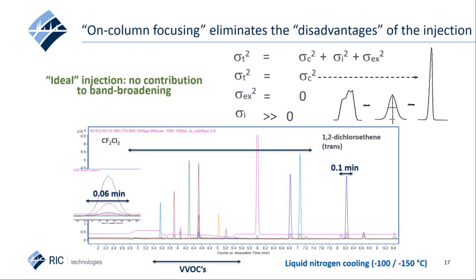Important, we eliminated the contribution of the headspace injection for the very volatile compounds, traditionally a drawback of the static headspace injection technique. You see the first part of the VOC chromatogram now, up to a retention time of 9 minutes, where besides vinyl chloride, also other very volatiles like chloromethane and dichlorodifluoromethane have perfect peak shapes, astonishing with even better base peak width than the typical 0.1 minutes or 6 seconds normally obtained on a narrow bore capillary column, a little more than 3 seconds.